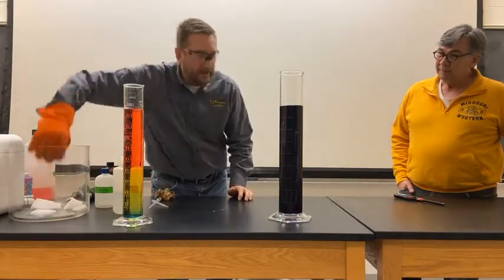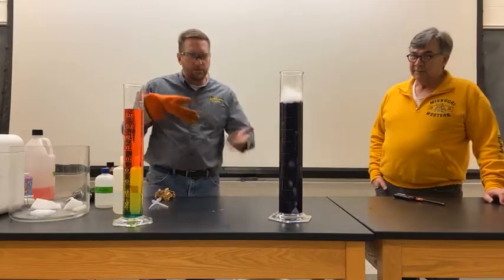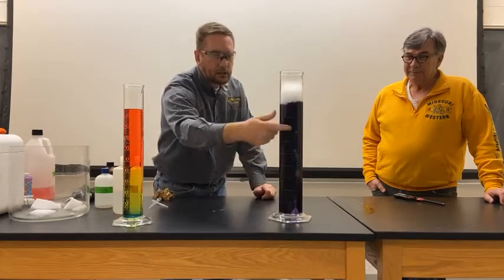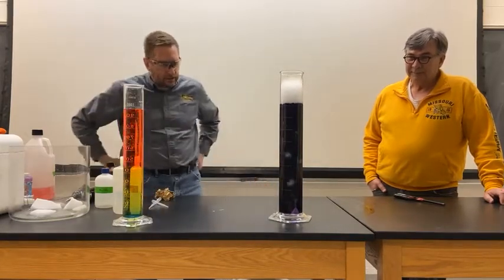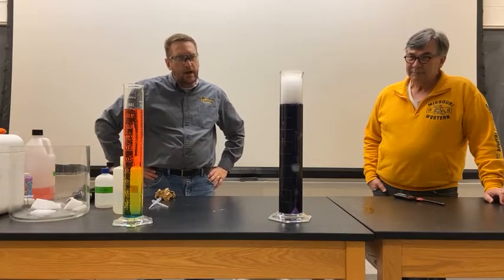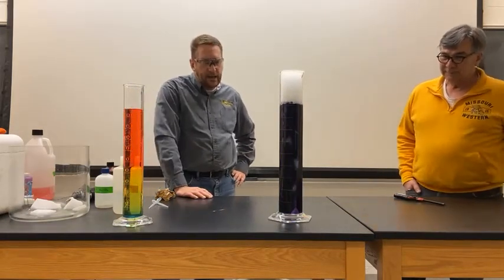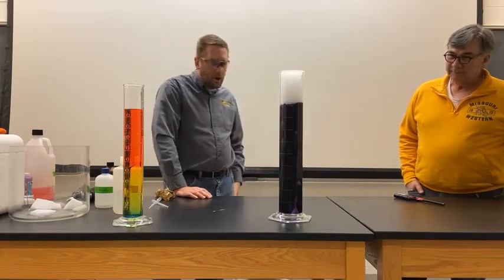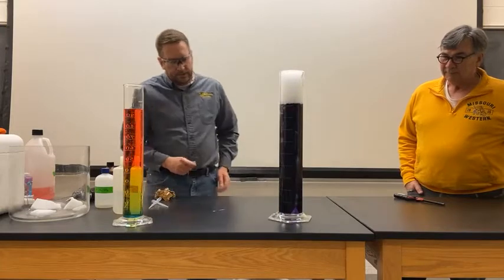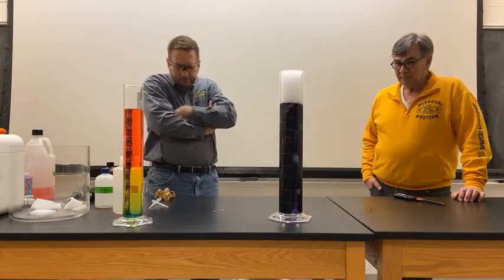So I'm going to take a small piece of dry ice, and we're going to drop it in there. We're going to let it bubble. So yeah, this is entertaining too. Right here's your edutainment. But watch the colors, okay? Watch the colors in here. So that's the piece that we're interested in, what effect that dissolved carbon dioxide has on our solution pH. So this will take just a few minutes here to develop.